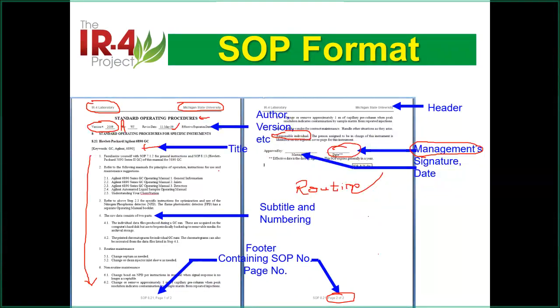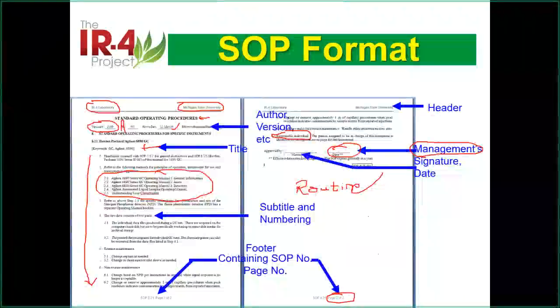That's in our lab. Well, I said some bad things, which I don't like. If you see here, yes, you can do that, no problem. What is this? This is referring to those manuals. If you have a GC, you typically would get a GC manual in older days. But nowadays they don't give you the manual; they give you an electronic copy. Then you have to print them and put them there. And sometimes the manual is so big. Then in this case, you have to archive your manuals, and then your archives will get too big.